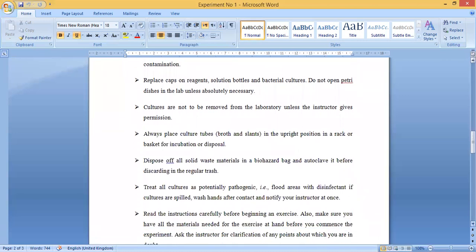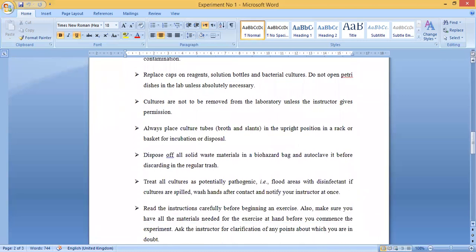Replace caps on all reagents. When you have used any kind of reagent — such as citric acid or acetic acid — caps must be replaced on reagent bottles, solution bottles, and bacterial cultures. Do not open petri dishes in the lab unless absolutely necessary; petri dishes must be opened in the fume hood or laminar flow hood only. All bottles and container caps must be kept closed.